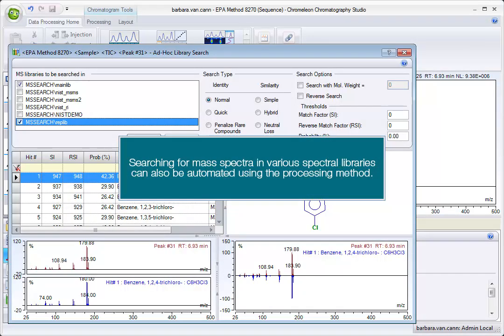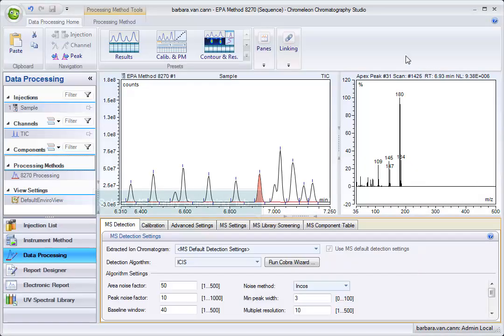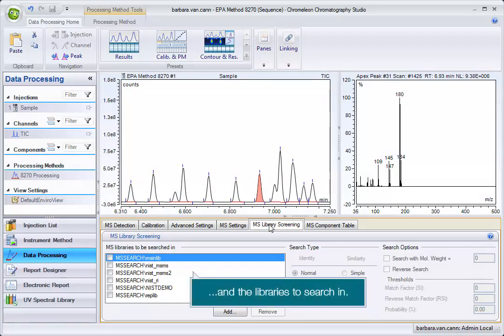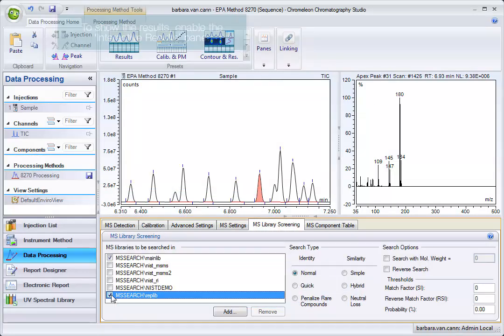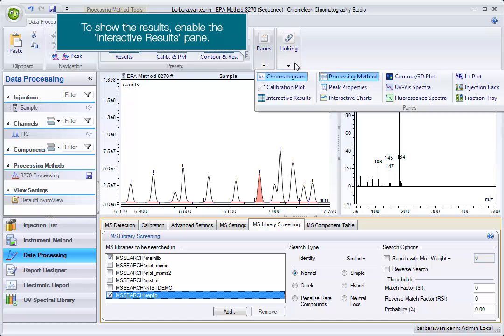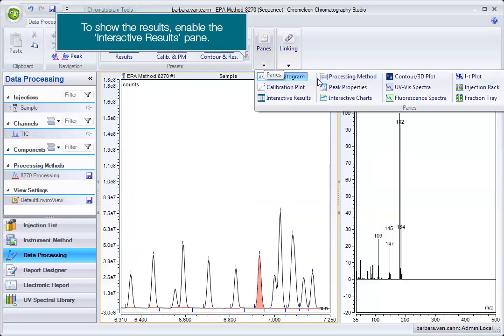Searching for mass spectra in various spectral libraries can also be automated using the processing method. Select the MS Library Screening tab and the libraries to search in. To show the results, enable the Interactive Results pane.